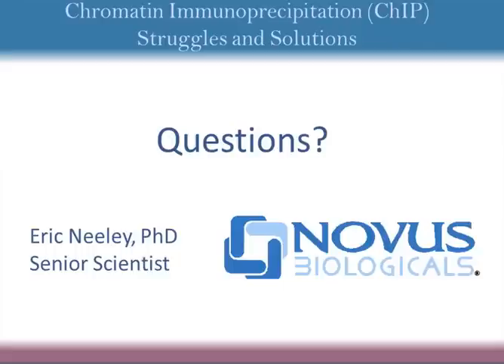Okay. All right, so here I also have a question from Denise Kimbra, and she's got a specific technical problem that maybe you can provide some input on. She's saying that she's consistently getting false positives from negative controls using agarose beads. Could it be the washing that is the problem, or the type of beads being used?